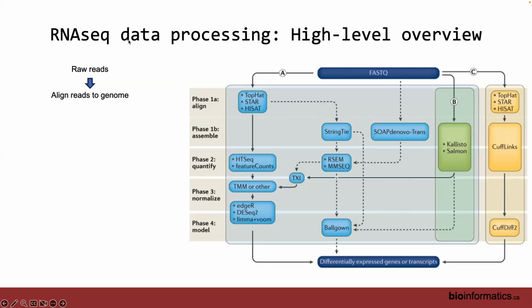The other thing that happens is once you align reads to the genome, there are going to be some reads that map uniquely and some that map in a few different places. And usually what we do is we throw out the ones that map all over the place. That happens to be its own subfield. People look at that like, oh my God, there's a duplicated gene family that's evolved, and it's involved in human brain expansion, but nobody studied these genes because whenever the aligner aligns the reads, we throw them out. That's fine. But to simplify, start simple. Uniquely mapping reads, okay?